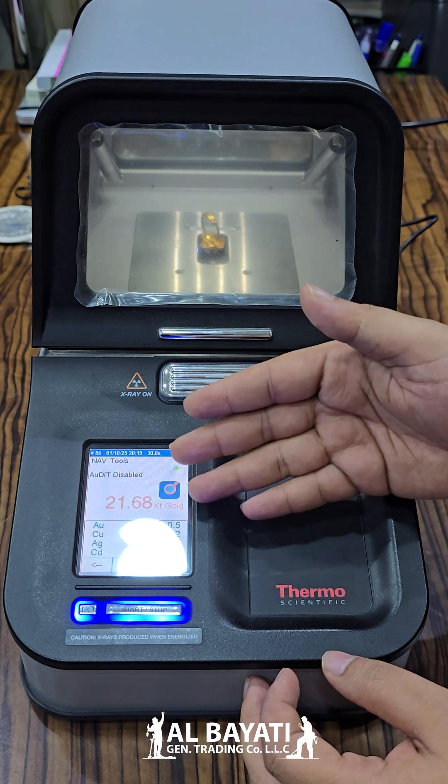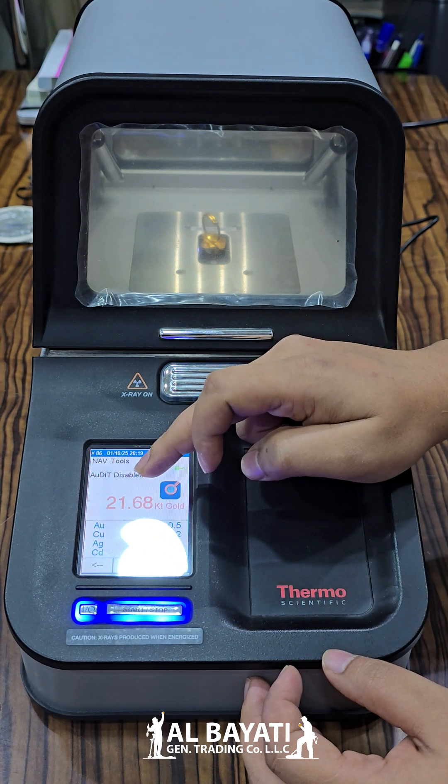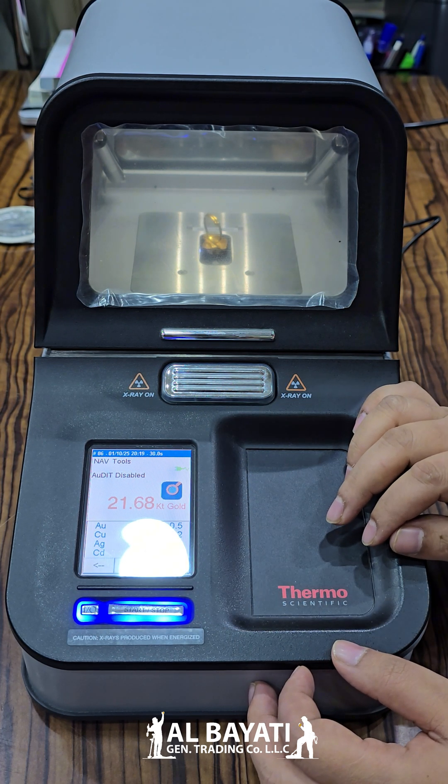See, automatically this light turns off and it is showing everything — how percentage is the gold. This is 21 karat gold, and how percentage is another metal — all showing on this one. Thank you so much for watching this video.